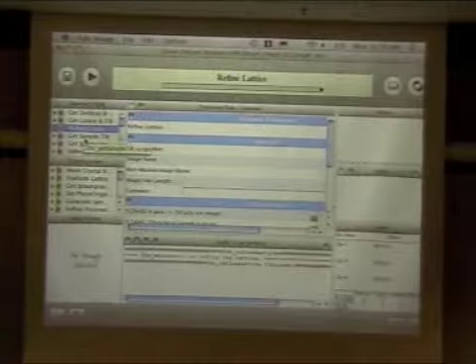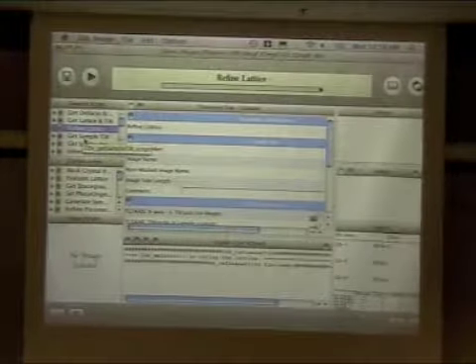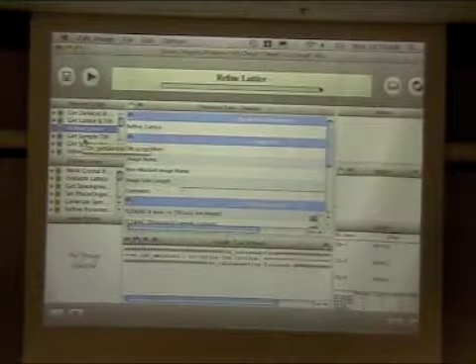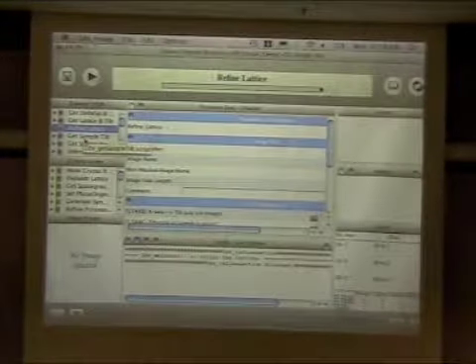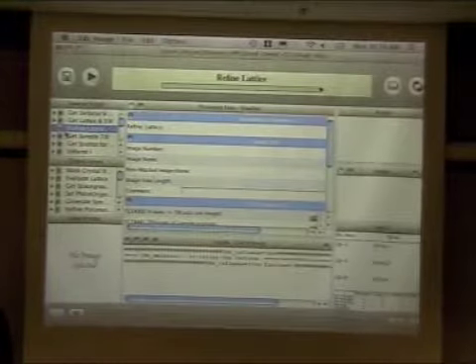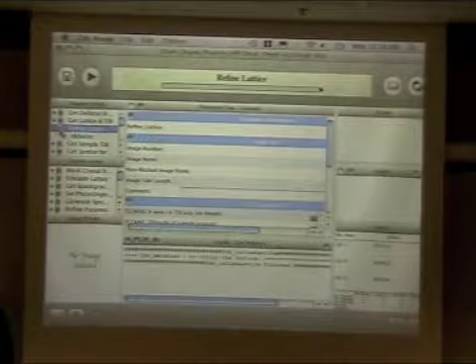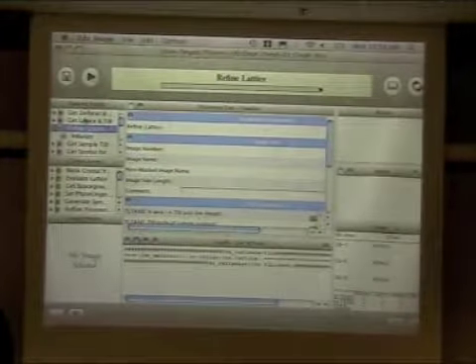Again, if you want some more detailed information about the layout here, what we're actually doing, please do come today to our last session on 2DX. Friday we'll be doing the 3D merging and so forth, where we'll get into more detail. What you see here in the standard scripts, though, is a little drop-down menu next to each of these.